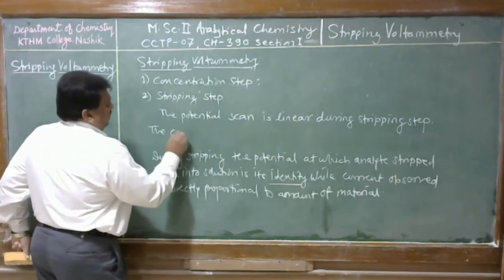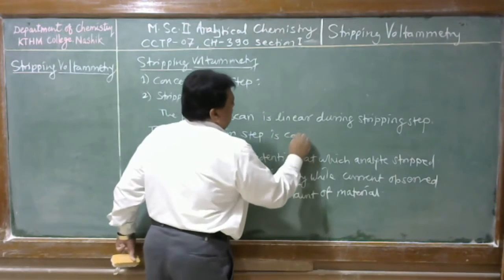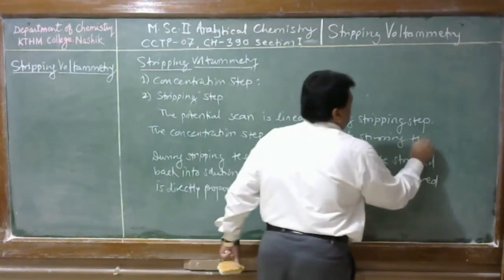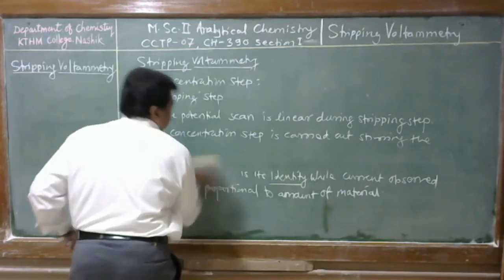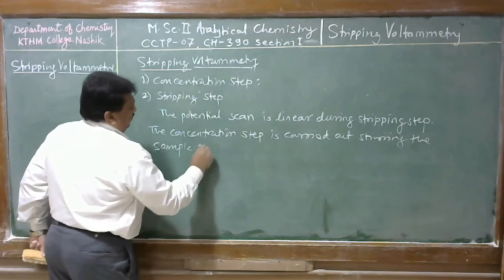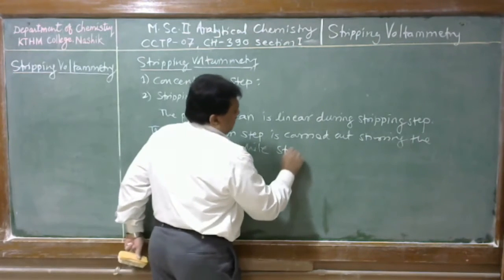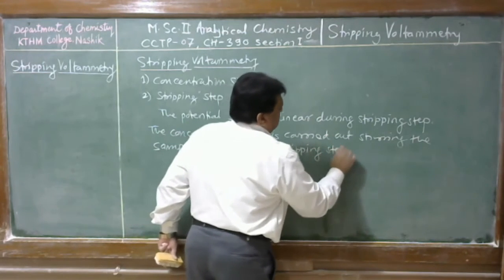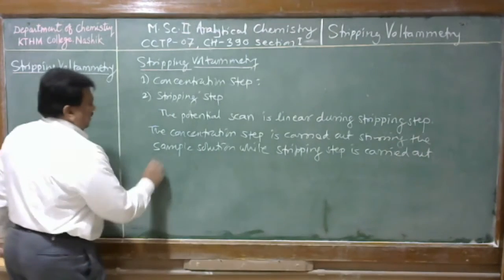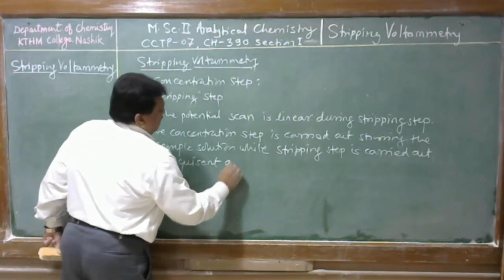The concentration step is carried out by stirring the sample solution, while stripping step is carried out in a quiescent analyte solution.